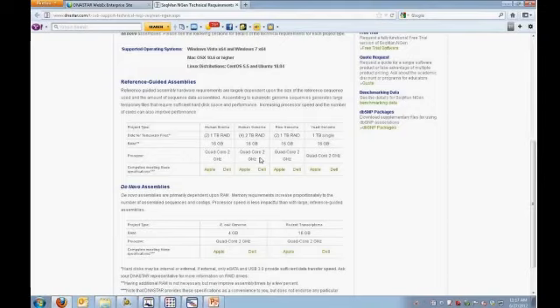And in fact, the new processors that were released recently, the Sandy Bridge processors, the i7s, perform really, really well and gave us a big performance boost. So these budget processors that can run at 3.5 to 4 gigahertz allowed us to accelerate our assembly times by 20 to 30%. So again, these are budget computers.